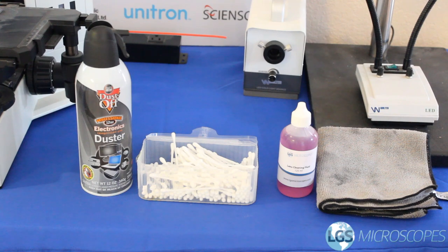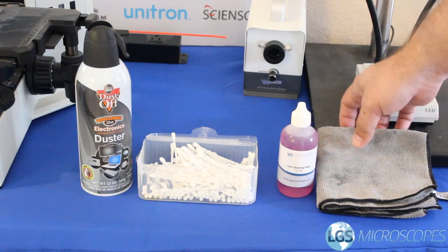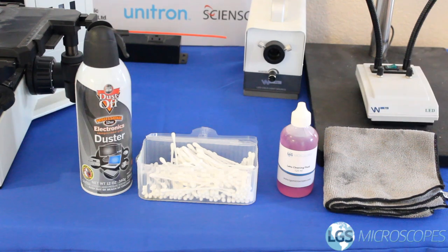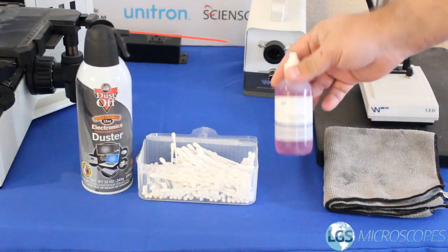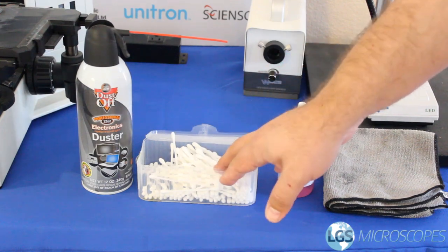You really don't need that much in order to keep your microscope clean day-to-day. It's helpful to have a microfiber cloth, a can of compressed air, some lens cleaning solution, and some q-tips.